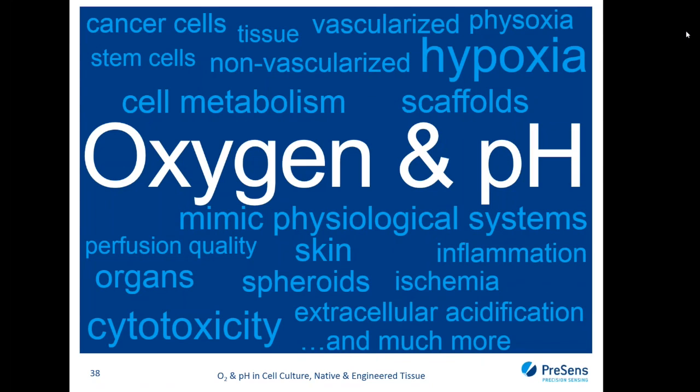First of all, there are some tubes that you can screw on top of your detector, and these tubes hinder ambient light from coming from the sides to be detected by the detector, and they also have the benefit that you have an adjusted field of view, and you can always have the same pixel resolution in your experiments. On the other hand, the sensor foils are covered with an optical isolation, which additionally blocks a certain amount of the ambient light. But I personally would recommend, for the best results, to use it in the dark state, or if you use it in the incubator, it's dark anyway. Dark state would be better.